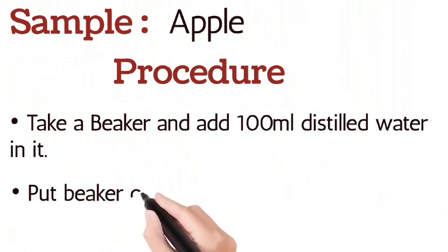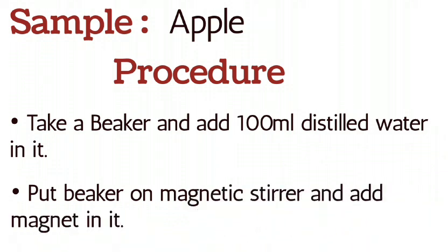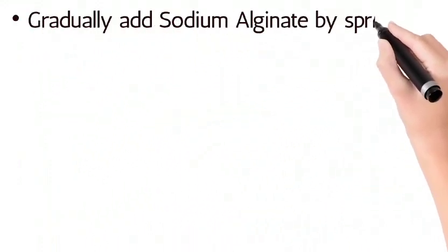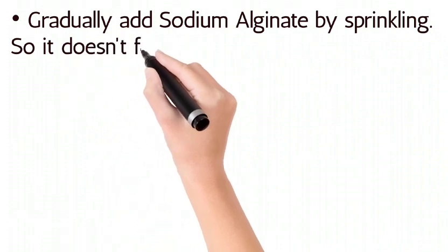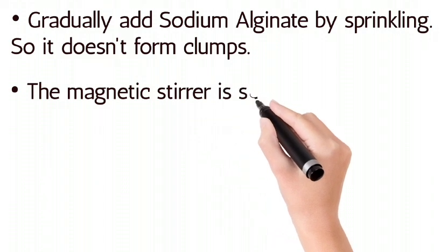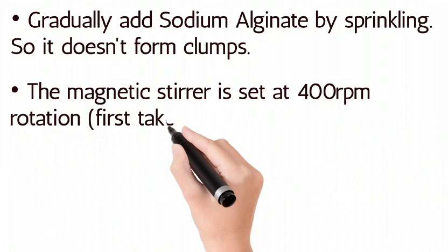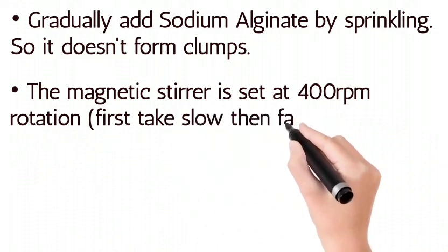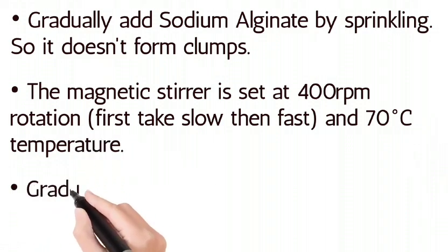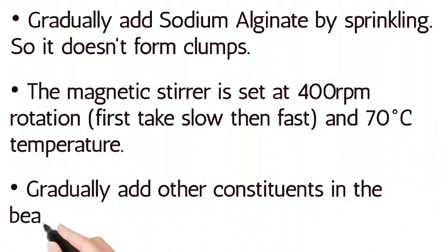Put the beaker on a magnetic stirrer and add a magnet in it. Gradually add sodium alginate by sprinkling so it doesn't form clumps. The magnetic stirrer is set at 400 revolutions per minute — first slow, then fast — at 70 degrees Celsius temperature.